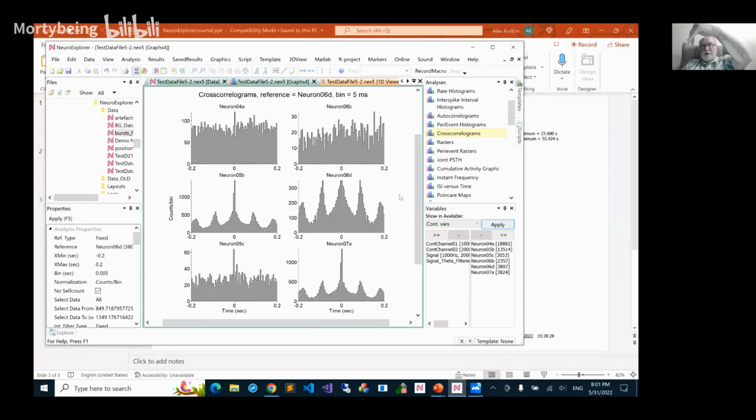It's like cross-correlation analysis of analog signals: when you have one signal and another signal, and the voltage goes higher on one electrode and then on the other it goes higher before that, you'll have a similar correlation graph.